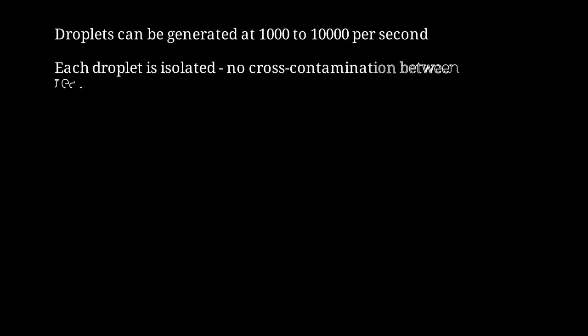Each droplet is completely isolated from its neighbors by the oil phase. This means there's no cross-contamination between reactions. Each variant gets its own private reaction chamber.